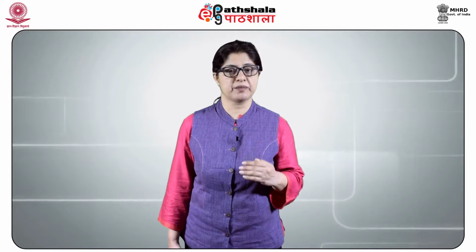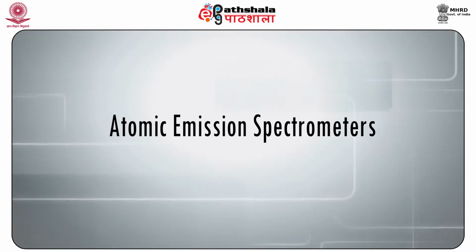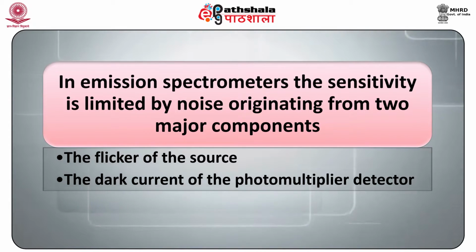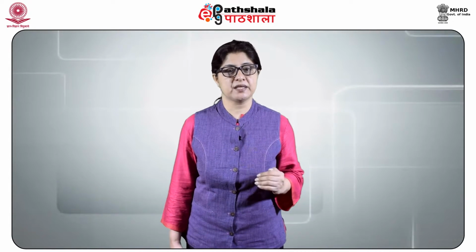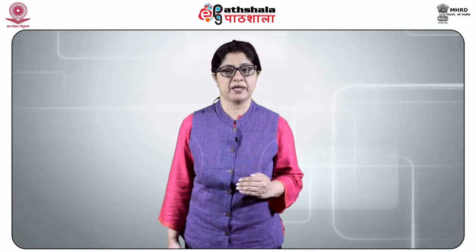Atoms are released from the sample surface by cathode sputtering. Atomic emission spectrometers. In the emission spectrometers, the sensitivity is limited by noise originating from the two major components, the flicker of the source and the dark current of the photomultiplier detector. Since the dark current noise remains constant, it is important to decrease the source noise of the spectral background by decreasing the signal band pass until either the detector noise predominates or the spectral line width is reached.